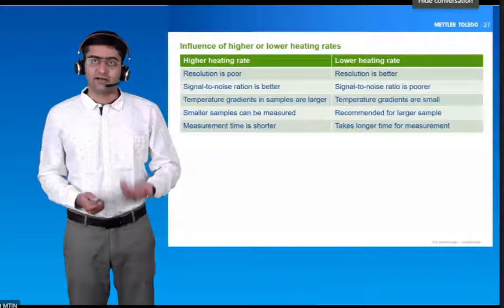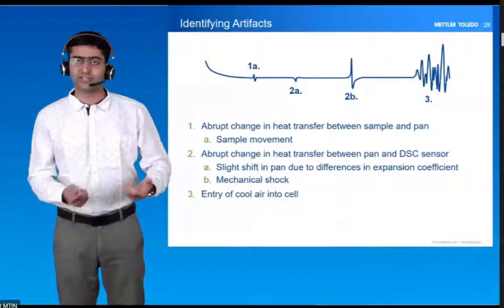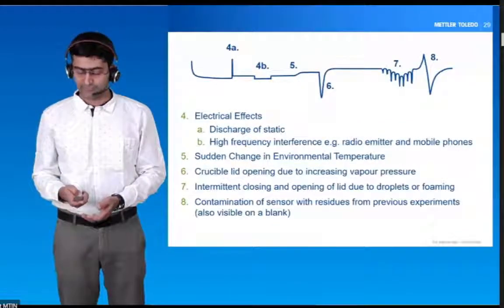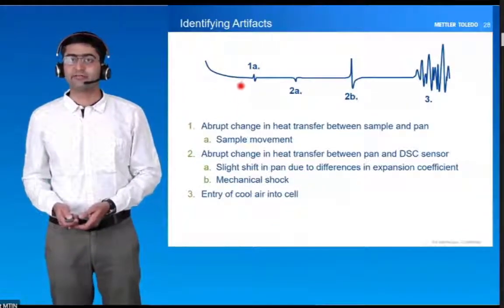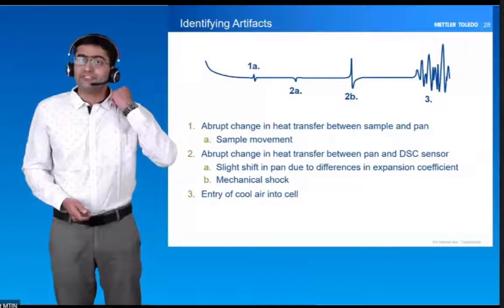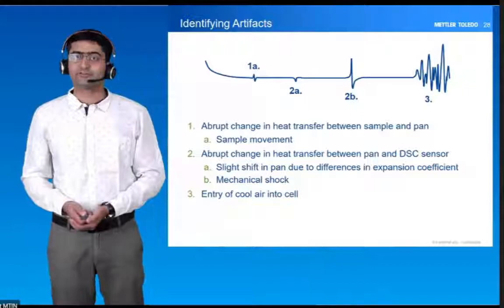Now, there are some artifacts possible in the DSC, and we have to understand many of these artifacts — what is the cause behind them. The first one is because of the movement of the sample: if a sample moves, you will have this kind of artifact. Then, if there is some abrupt change in the heat transfer between the pan and the DSC, for example a slight shift in the pan due to a difference in expansion coefficient.